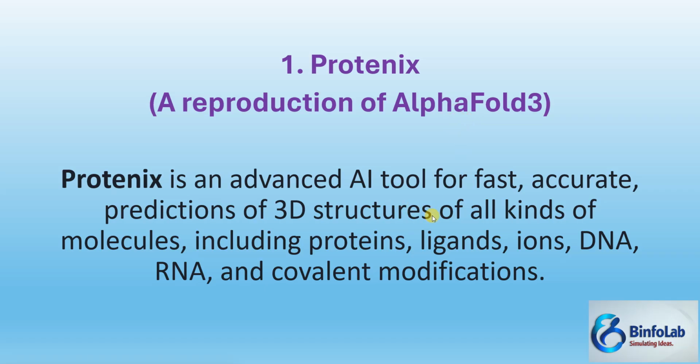But the good news is that with this method, we will be able to dock, I'm using the word dock, or to incorporate all kinds of molecules with a protein, including ligands of your choice, ions, DNA, RNA, or if you are interested in certain covalent modification or some protein modification, you can do that as well.